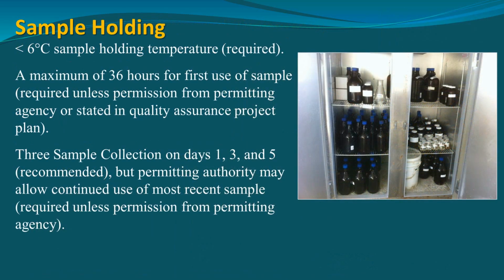I mentioned earlier, we're not allowed to hold the sample for very long. Toxicity has one of the shortest holding times. Within the EPA protocols, there's a maximum holding time of 36 hours for first use of the sample. This is one of the easiest quality assurance steps to violate within a toxicity report. We're going to talk more about reviewing toxicity reports tomorrow, and we'll talk a lot about holding time.